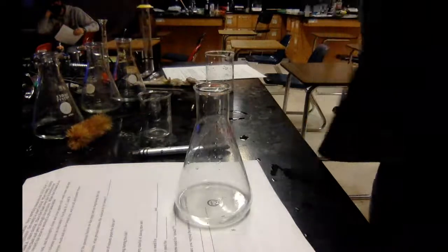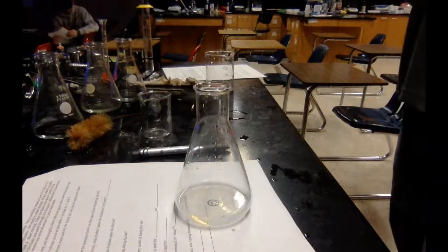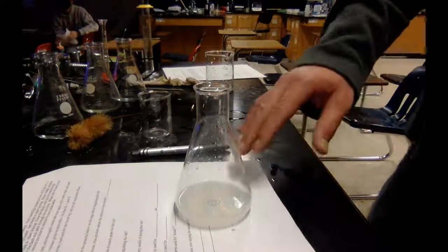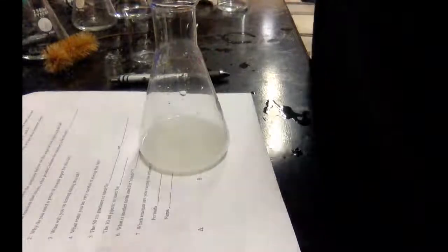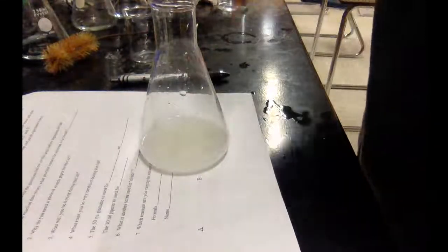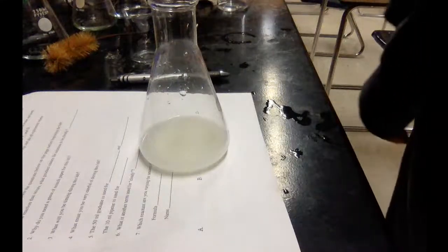So what's happening right now is the reaction is taking place and we're forming what? Sulfur. That sulfur then will start to darken this. And as you can see, it is getting cloudier. And I'm looking down through here, and whenever I can no longer see it, I call it. That's the time of that reaction. So then you do that for all the trials there.